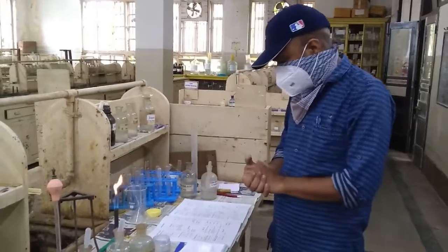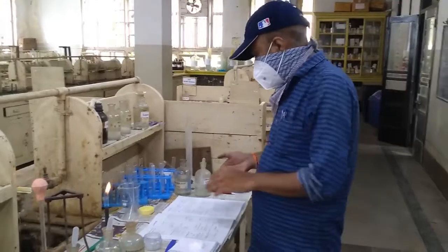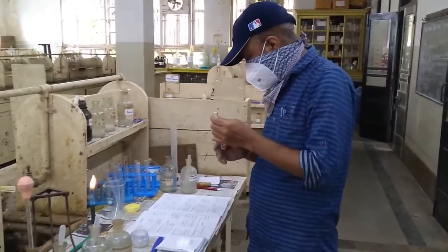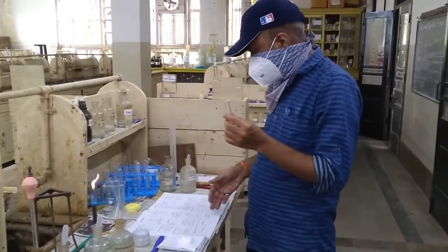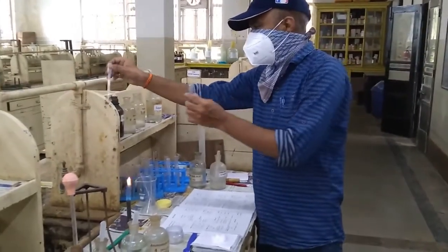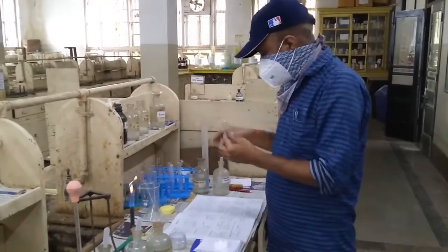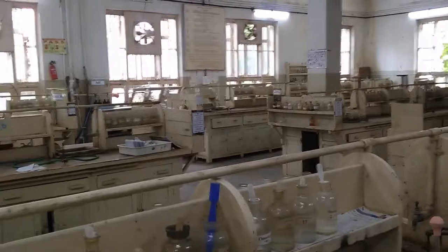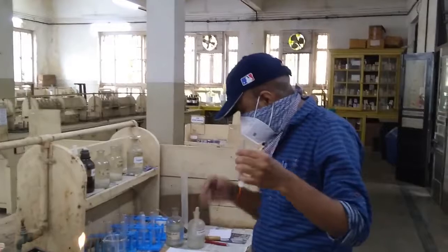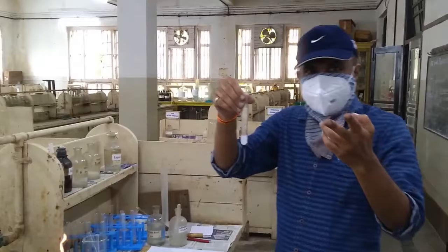The first CT we have seen, and the second confirmatory test is original solution plus sodium hydrogen phosphate. Now let us see the second confirmatory test, this is the original solution. Let us take a little amount of sodium hydrogen phosphate. See here, I will take a little amount. So again it gives a white precipitate. This white precipitate indicates the presence of Al3 plus. So here we have seen two confirmatory tests.